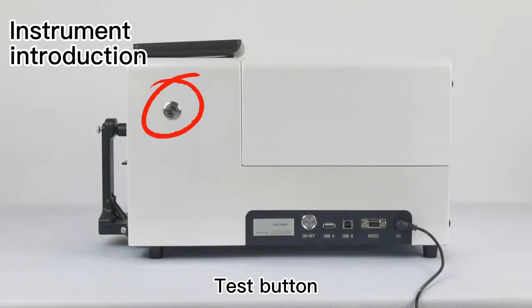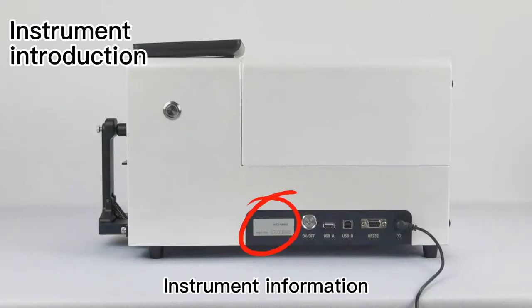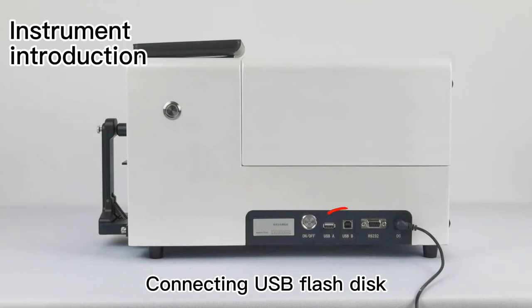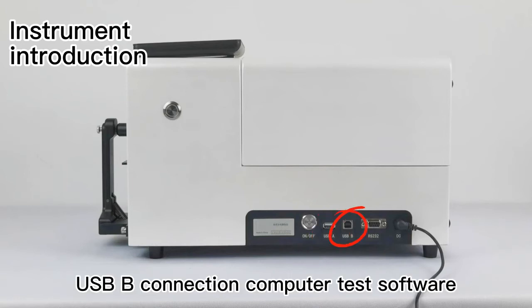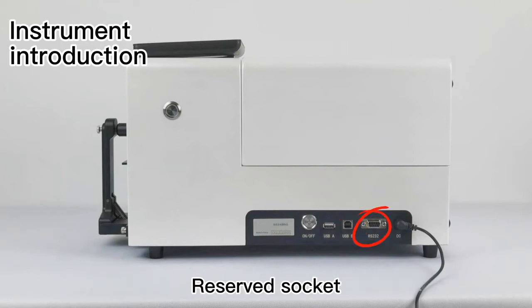Instrument Introduction: Test button, instrument information, on-off key, connecting USB flash disk, USB-B connection for computer test software, reserved socket, and power.